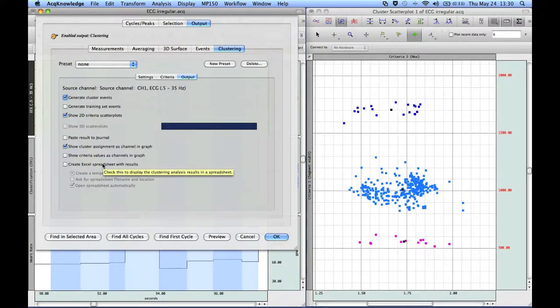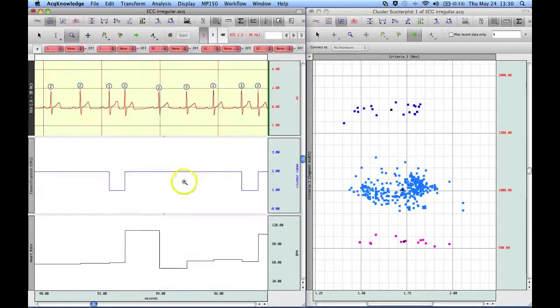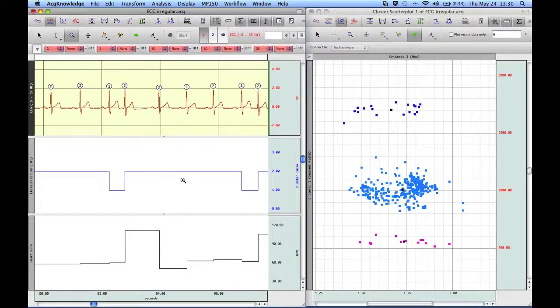Anyway, that concludes our demonstration of the find peak cycle detector clustering output option.